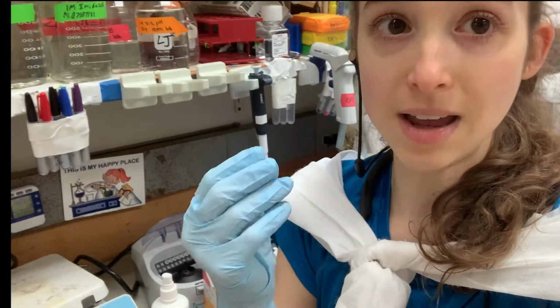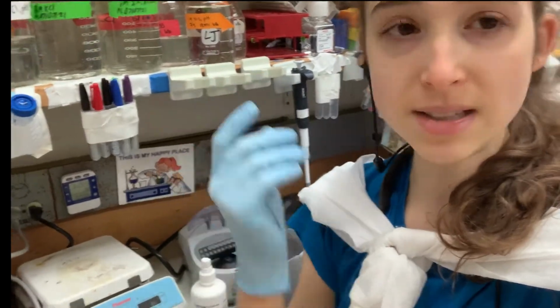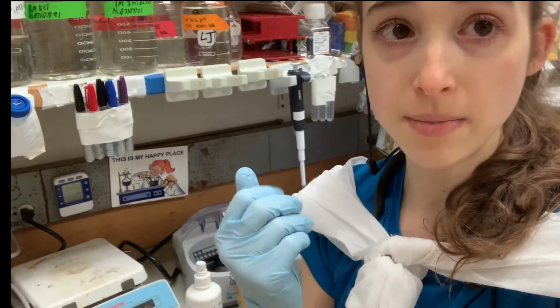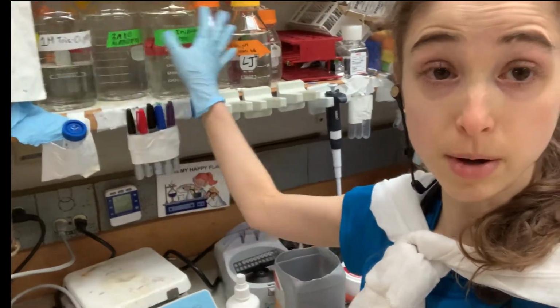Like we add those at the time. And so first we make up all these solutions and then we can add the things, mix them together and add it, and make that all fresh whenever we want a solution. We can also do things like, so sometimes it's good to have these individual components as is.